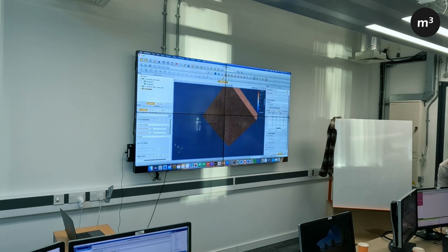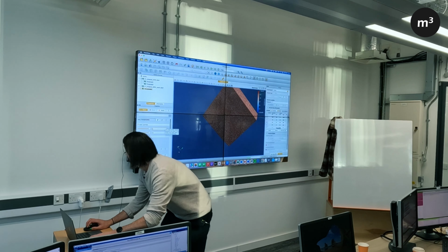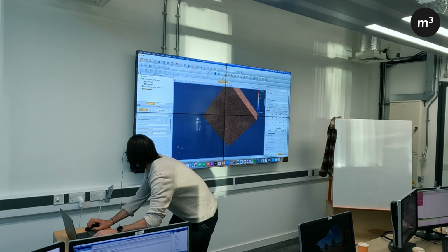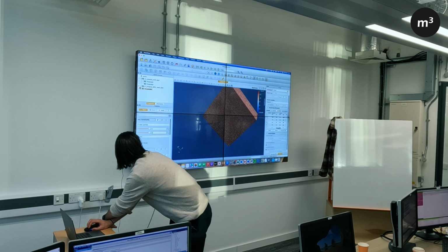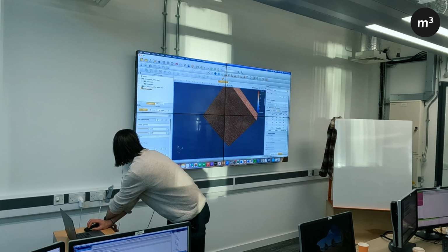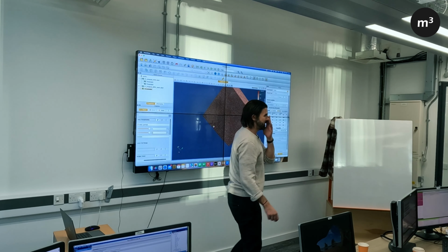So just to simplify that a bit, if we go mask partial, exactly the same procedure as before. 1, apply. Again, this should be quicker with your machines, hopefully.